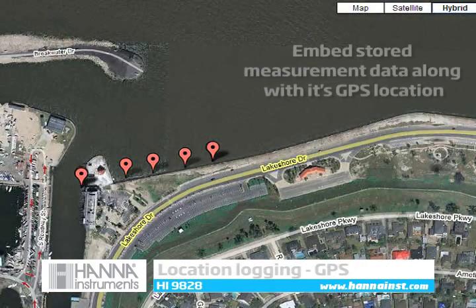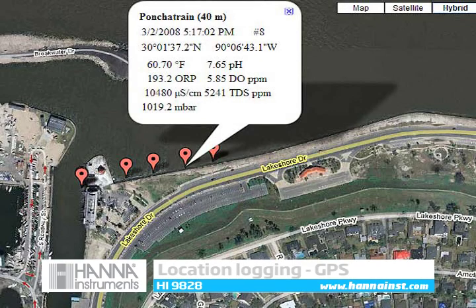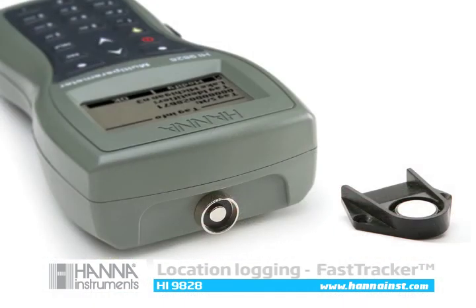The HI9828 features a GPS receiver that can track and embed locations with measurement data. You can view measurements along with GPS data using popular GPS mapping software. Our fast tracker tag ID system can be used in tandem with GPS in the event of low GPS signal strength.